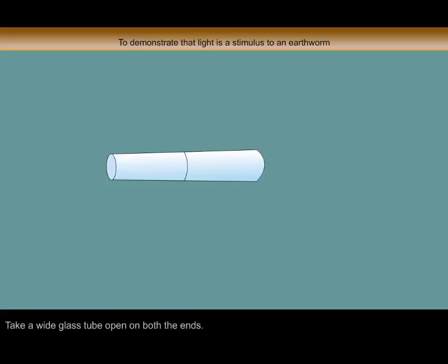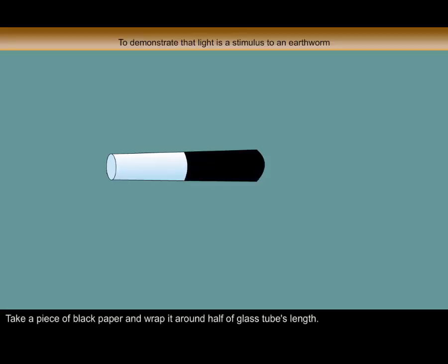Procedure: Take a wide glass tube open on both the ends. Take a piece of black paper and wrap it around half of the glass tube's length.